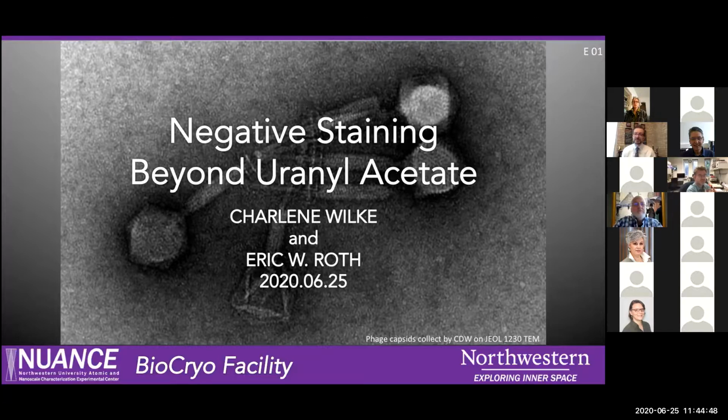So hopefully we can just keep that down to a minimum. Yeah, but if you have a container and it started to precipitate, you can have a couple of mLs and you need to get rid of that waste. So I'm wondering if that's also what she's talking about, right? Yeah, for sure. But you're right. We don't use large volumes of it in general, right?